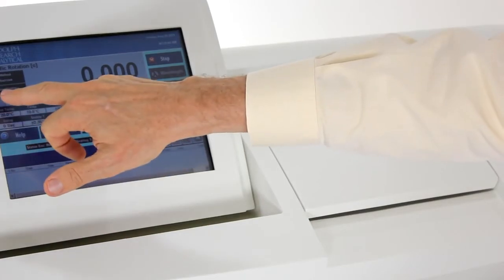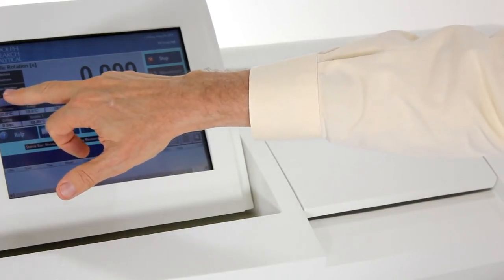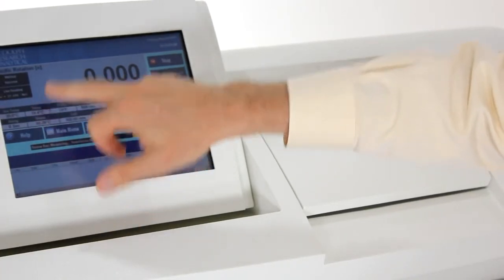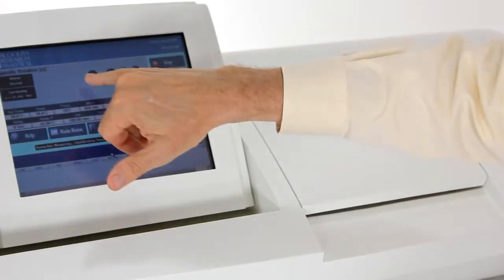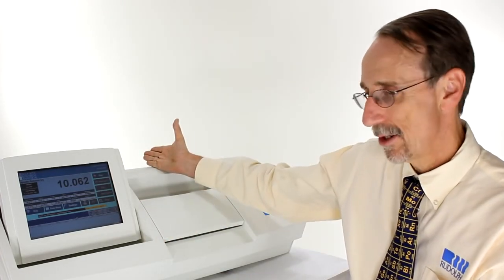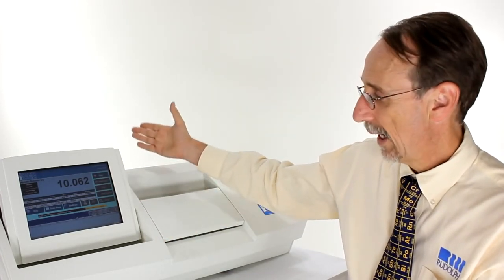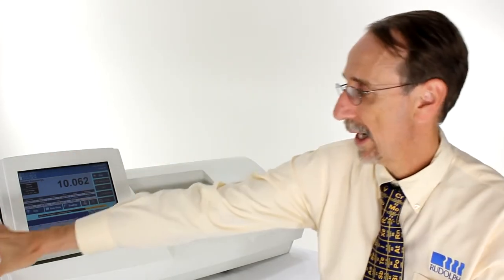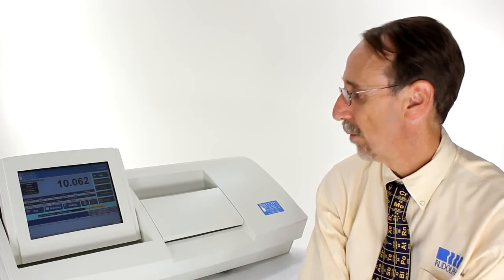It will measure the optical rotation and display this under the live reading. It will then calculate the specific rotation using the formula within the USP and display on the main screen. In this case we're just looking at the screen. We could also have the instrument connected to a network and it would save automatically to the network, or we could have it connected to a printer and the result would print automatically.